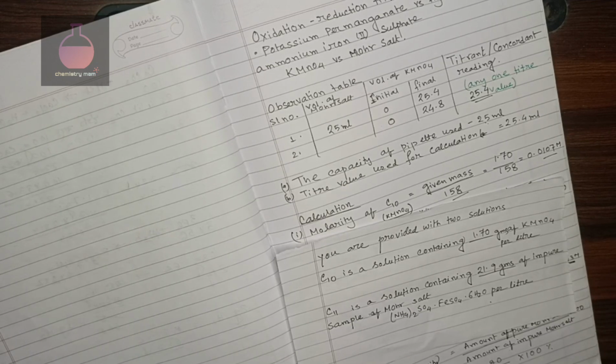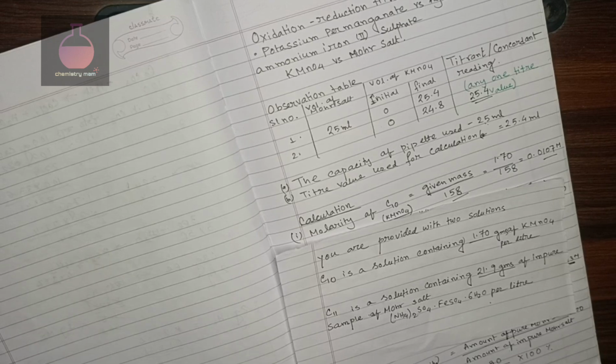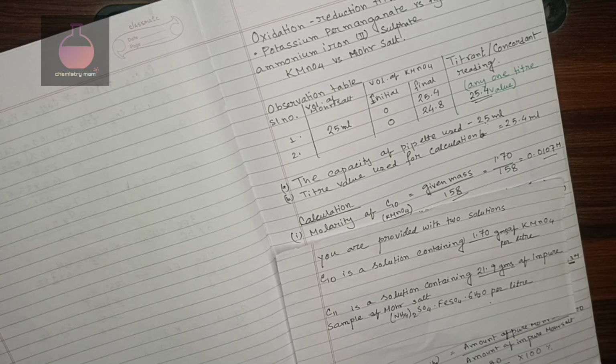But one thing again, listen: this can come up to 95%, 97%, but it will not cross 100%. So if it crosses 100%, only then can you understand that something is wrong. Don't think that your value is not coming 99%. It will not always be like that.